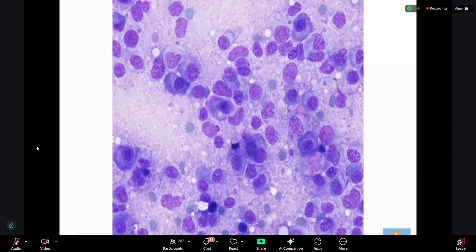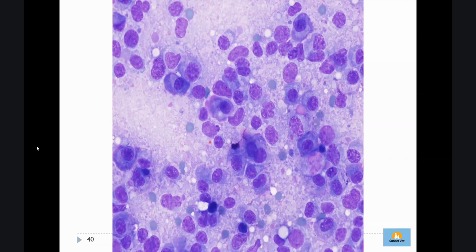I don't think it's epithelial. It's more round, because between one cell and other cells, they don't attach to one another. And then for the round cells here, you have to think, okay, is there any granules or is there any vacuoles?